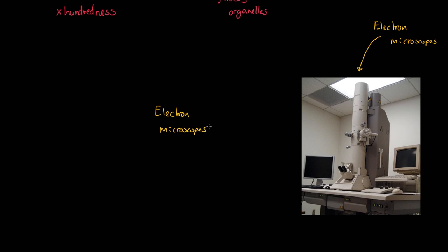I mean, first of all, let's be hugely impressed at how beige someone has made an entire room. It's quite spectacular how dull you can make something look. But nevertheless, let's give some big picture features of these electron microscopes. Well, first of all, I want you to realize there's two types. One's called a transmission type, more of which in a second. This is the type I'm going to draw for you in a moment. But we also have something called an electron scanning type.